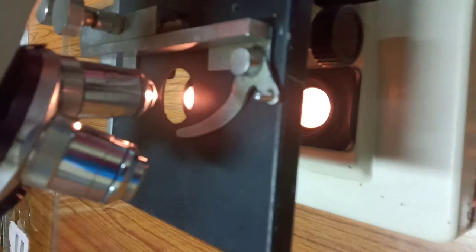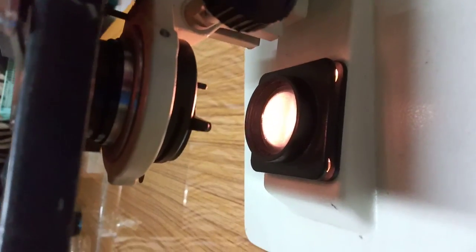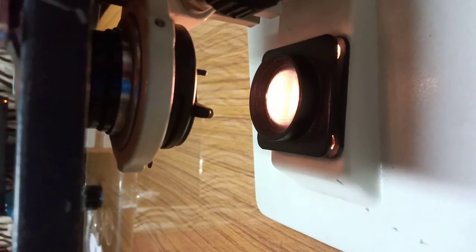A microscope has two lenses, the ocular at the top of the body tube and the objective lens at the end of the body tube, close to the object to be examined. Both these lenses have magnifying power.